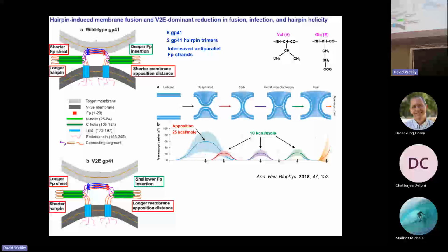Yes, we actually did that kind of labeling first. That was work done by Scott Schmick. It was really through that approach that we showed very clearly, with the analysis, that we only had anti-parallel beta sheet and none of the in-register parallel beta sheet. So we did do those experiments.